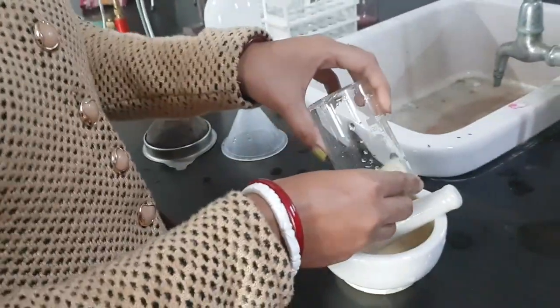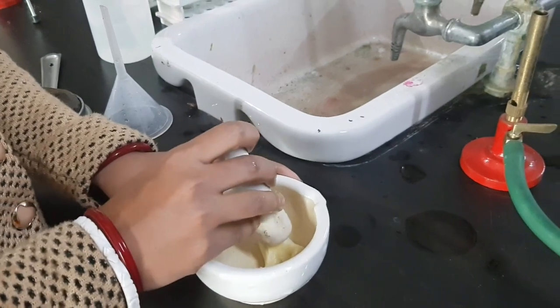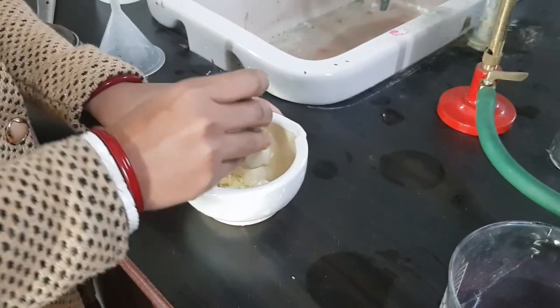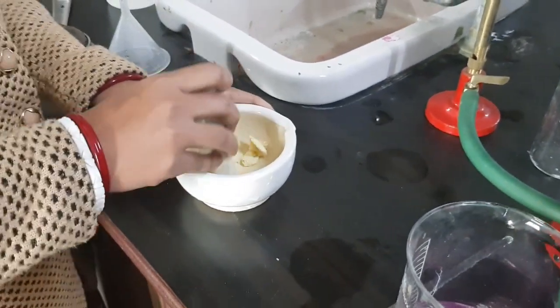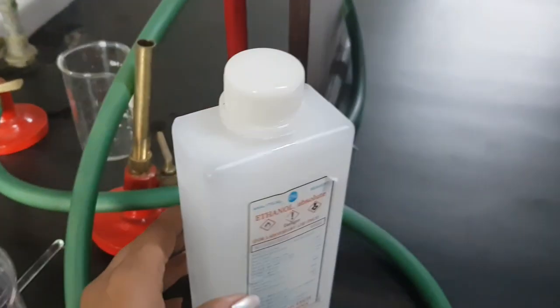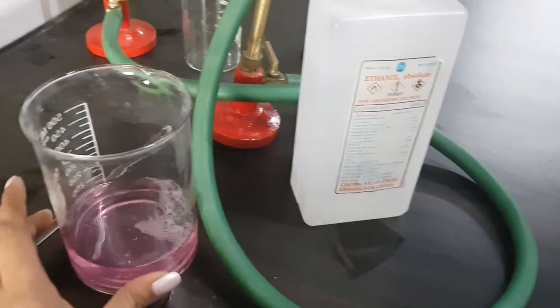First we have to take the banana — any kind of banana. Then we have to smash it in a mortar and pestle. So what are the things required? We need chilled alcohol, that is ethanol. We need one banana, and one more thing. We have already mixed the things.